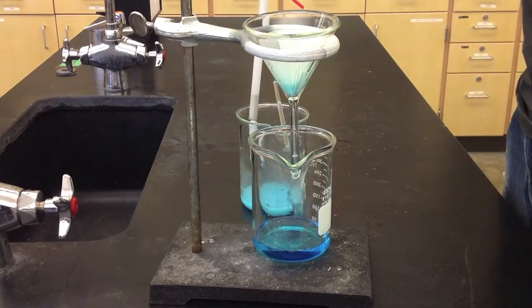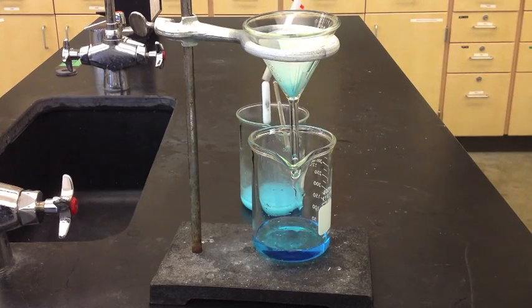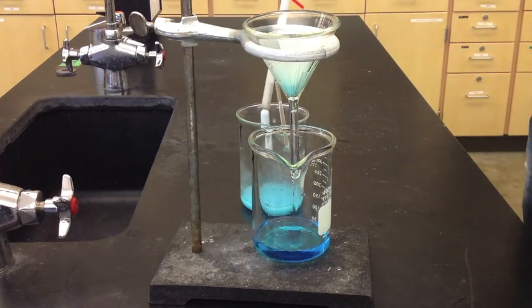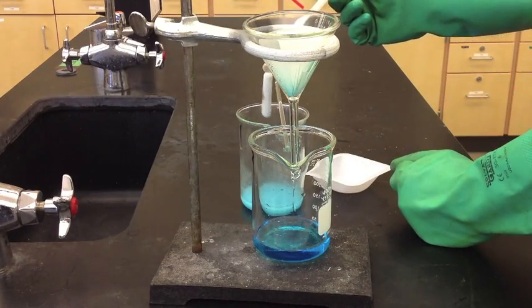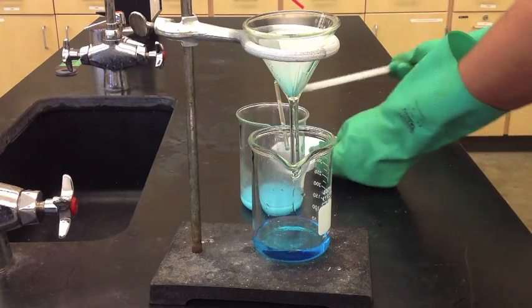At this point, pull the stir rod out — you probably should have done that beforehand. Pull it out with the magnetic stir rod remover, make sure you get all the material off, and then put it somewhere safe so you can rinse it off and take care of it properly.